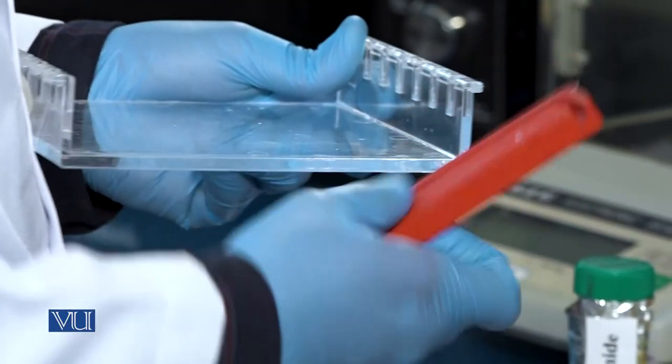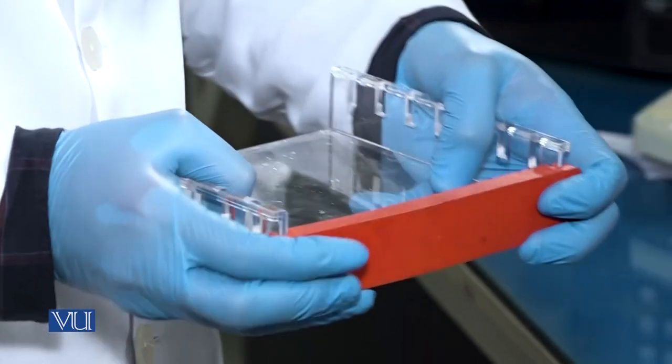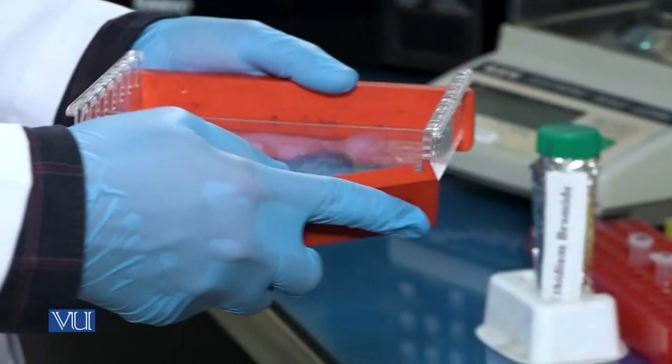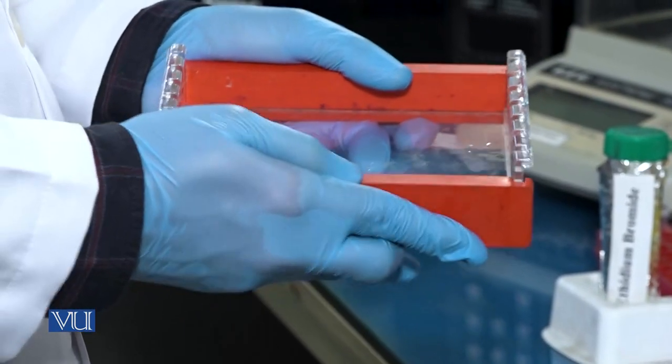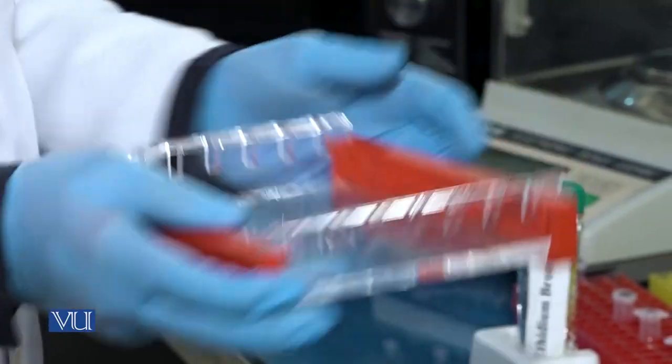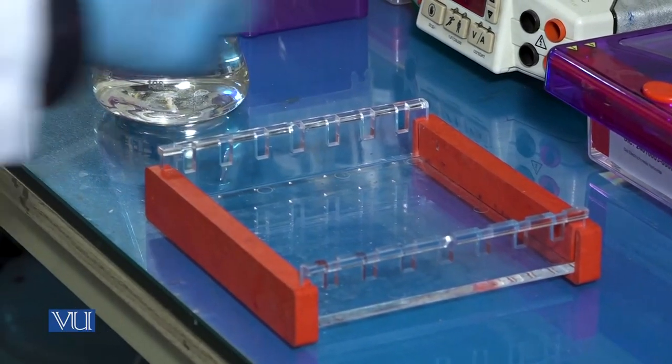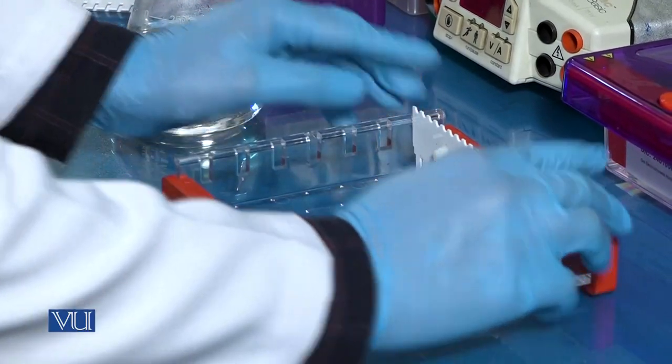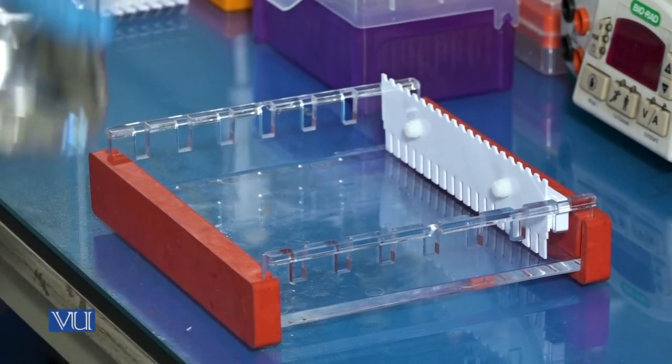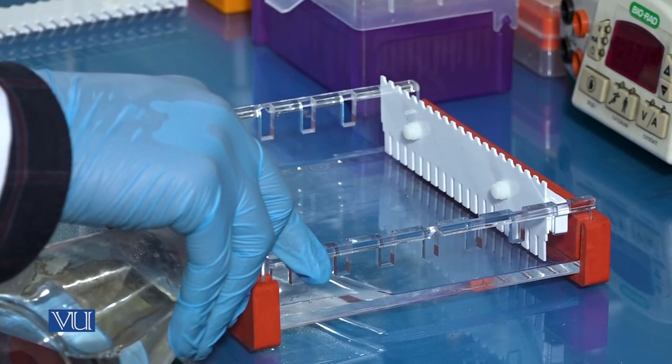After adding the ethidium bromide, now assemble the gel caster to pour the gel. Place comb in it to make wells. Now pour the gel in the caster carefully.